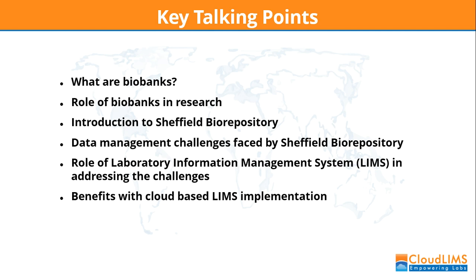I'll give you an introduction to our biorepository here in Sheffield. We'll look at what the data management challenges were that we faced and how we overcame them with a rollout of a LIMS system that could meet our needs. And then I'll speak about the benefits of a cloud-based LIMS implementation in particular.